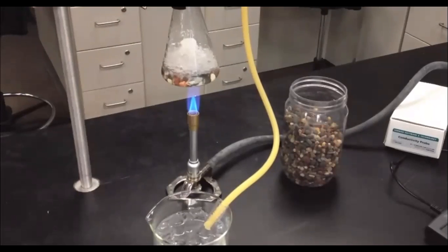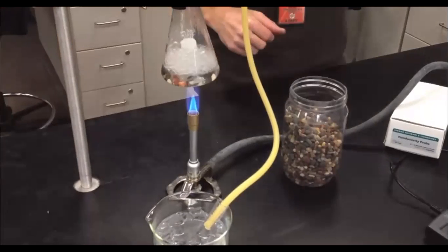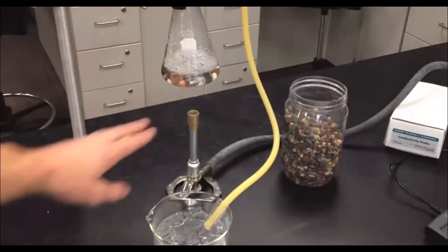When it looks like you've got enough distilled water collected in your test tube, go ahead and shut off the flame by turning the valve off. Don't just blow it out here, the gas will still come out. Now what we really want to do is get a reading on what's the conductivity of the distilled water. So again, you might burn yourself if you grab that, just be careful.